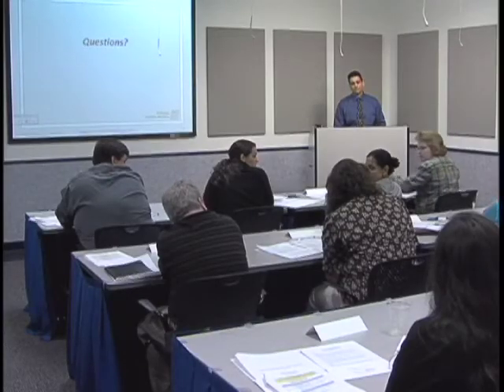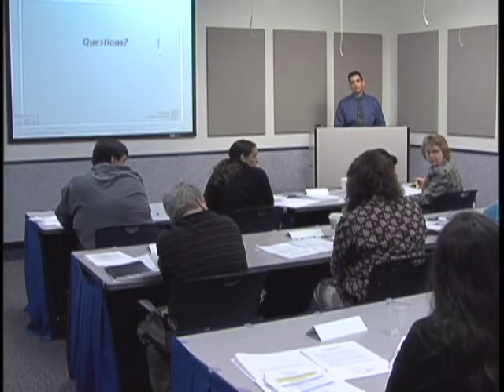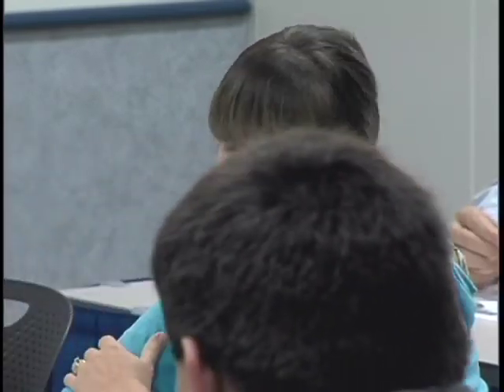Right. Yeah, we have ours validated, the summary's written, and now we're at the point of trying to figure out exactly how we want to implement it. We did the same thing. We're sticking with our original RFU threshold right now, and basically looked at a picogram amount where we were going to see stochastic effects, so we're not going to amplify anything below that. And now we're just trying to figure out if we're going to use it routinely all the time, or shoot those samples normally and then go back and clean them up if we see something below the threshold.